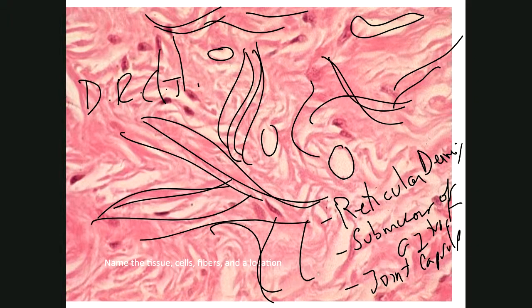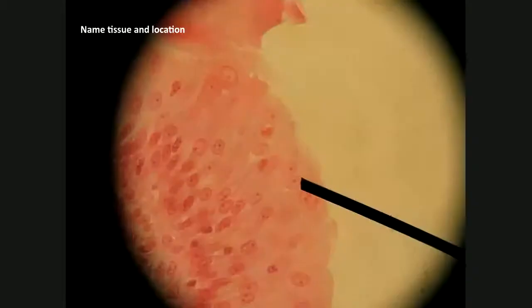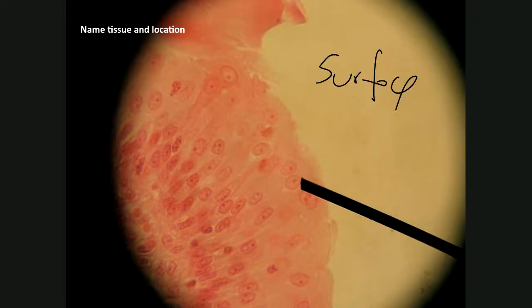All right, moving on. This guy right here. Okay, first of all, surface. That's the giveaway that this is epithelial tissue. So the next question is, is this simple or stratified? Okay, so this is the nuclei of a cell, the nuclei of a cell, the nuclei of a cell, the nuclei of a cell. Okay, these are layers of nuclei. That tells you this is a stratified tissue. It's going to be a stratified epithelium.